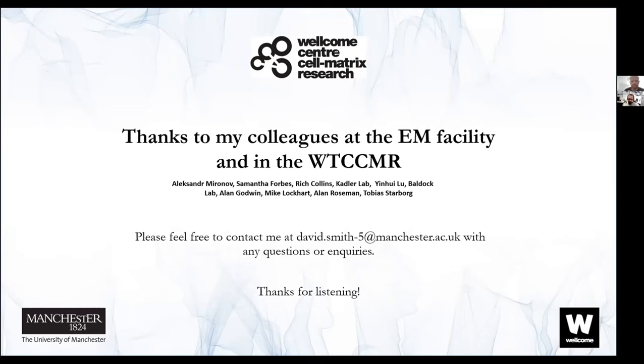I think there is a question for David about SBF-SEM, serial block face SEM, from Michael Murray. It's a great talk, David, about serial block face SEM. Is there a way of correcting discrete misalignment along the Z-axis in the stack? That's for you, David, I think.